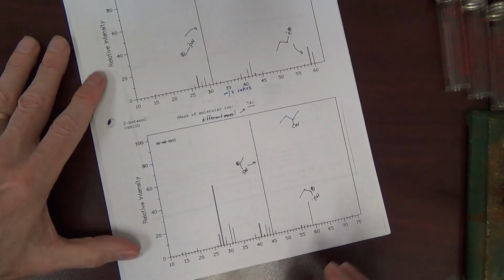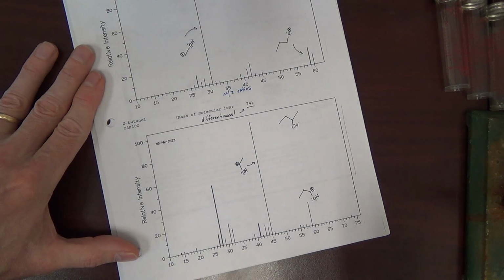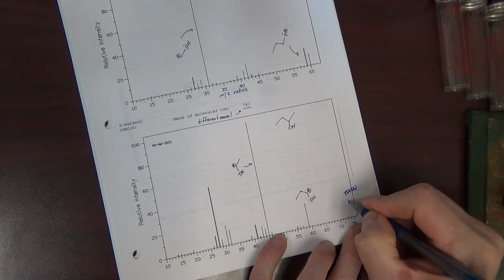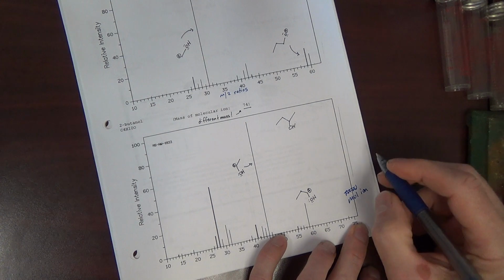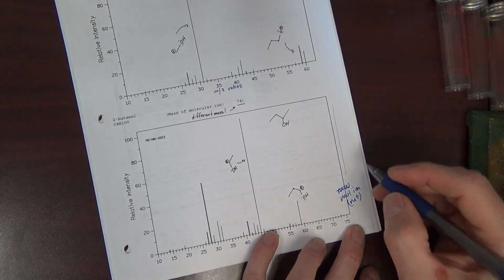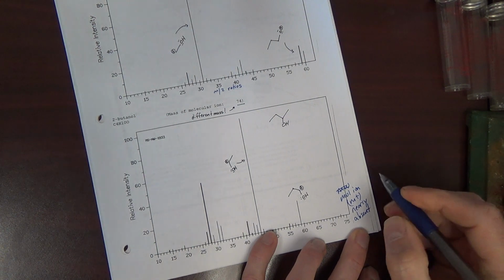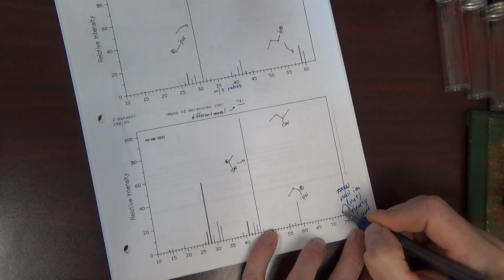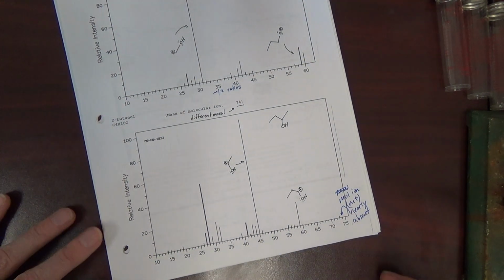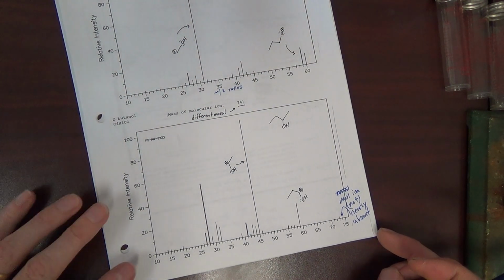Below, this alcohol has a mass of 74. Now actually in this example, the so-called molecular ion, which we will call M+, is nearly absent. It basically is absent. At 74, we expect a peak, but it's basically absent. That's a bit unfortunate for this early example, but it is something that we need to be aware of and may see along the way.